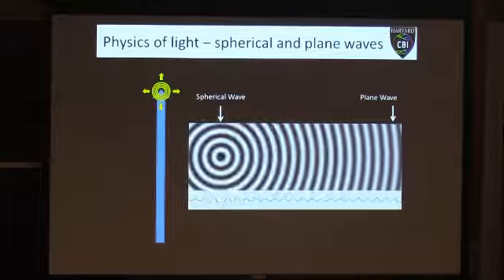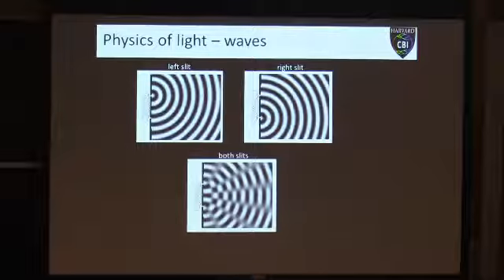So just a straight line. So what you can do is if you take a plane wave that's coming in and you have one little slit, you actually then get diffraction, which turns that plane wave into a spherical wave again. Okay? And so that's if just the left slit's open. If you have just the right slit, you have the same thing, just shifted a little bit.